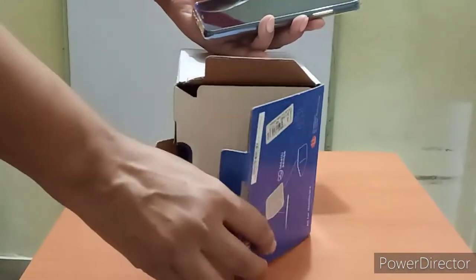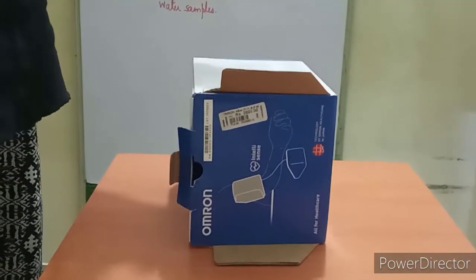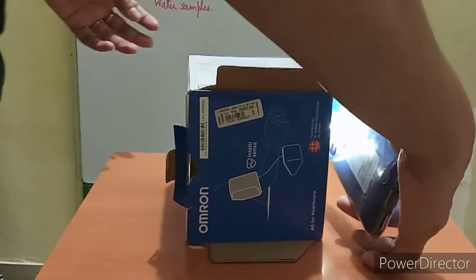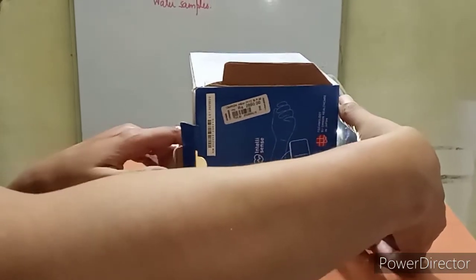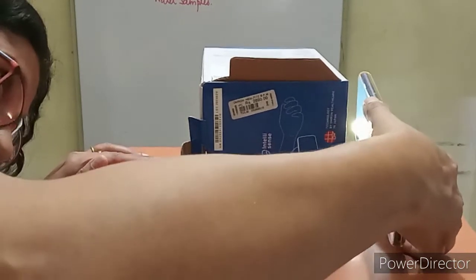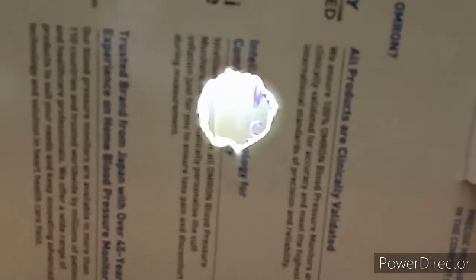This way we have closed the box, and on the other side we are going to put the torch light so that the torch light can pass through this, and from the other end we are going to observe the water sample which is kept inside and see the particulate matter if it is present in this. We can see that the water of this water sample A is clear.